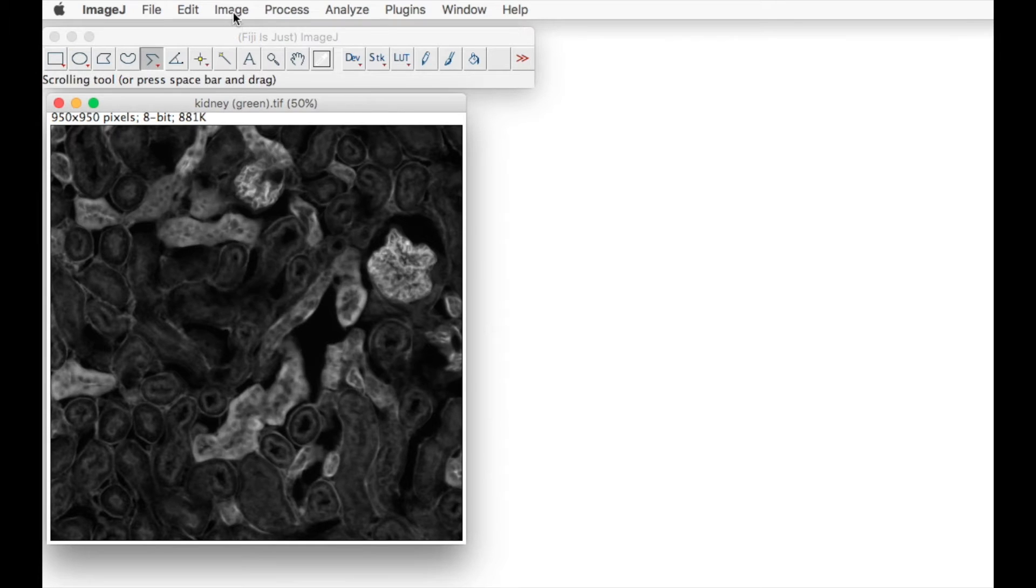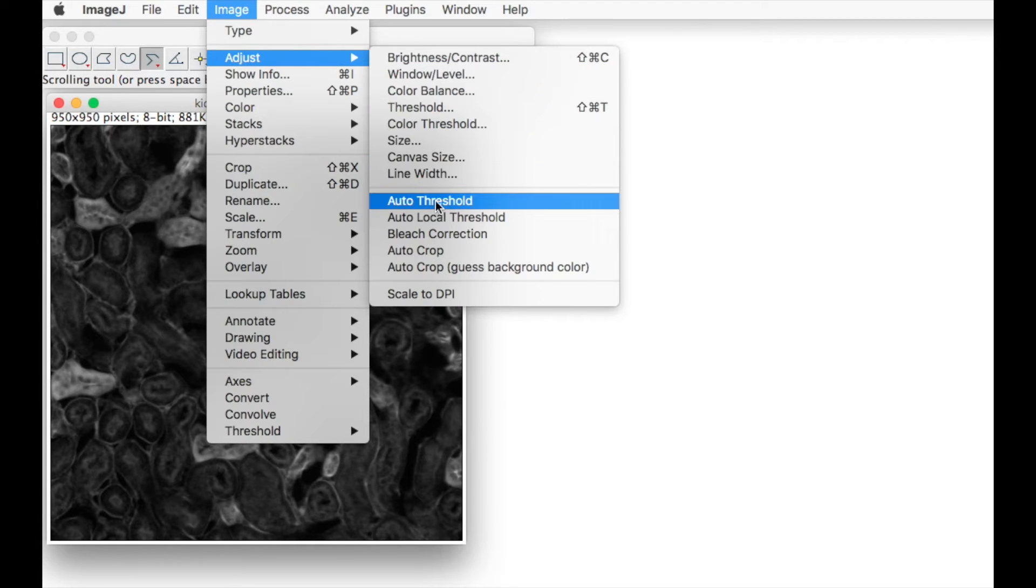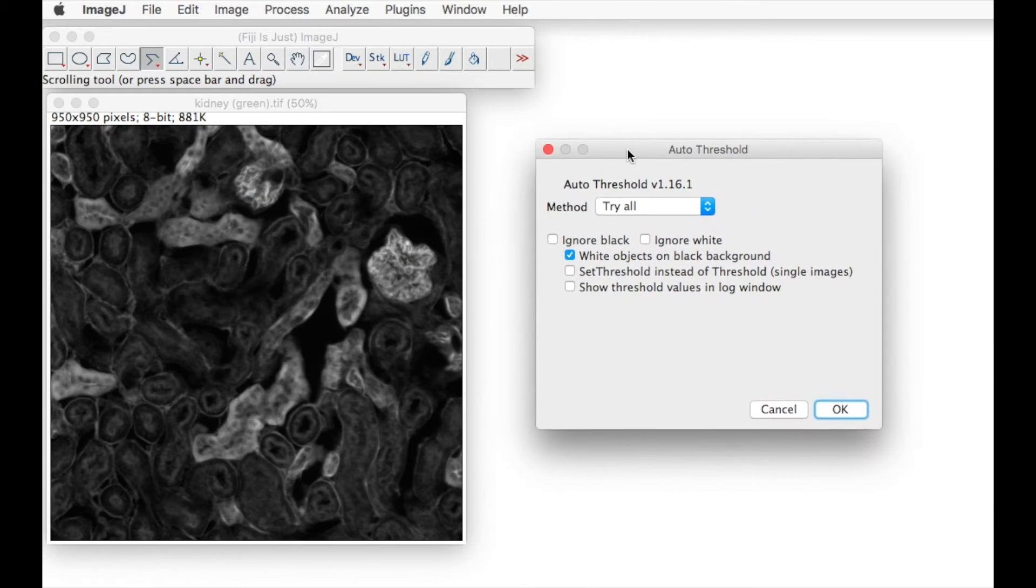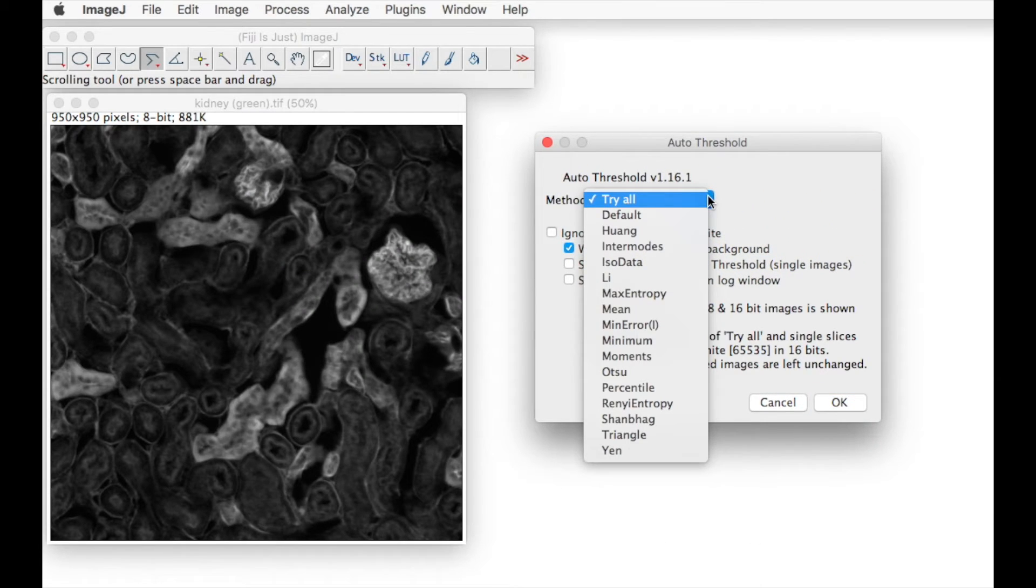In order to see which type of threshold works best, we can go to image, adjust, auto thresholds, which allows us to try all of these functions.